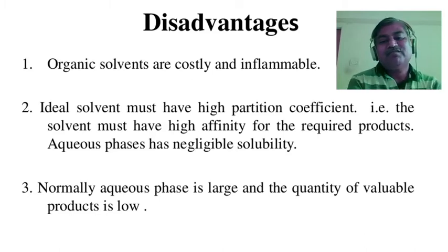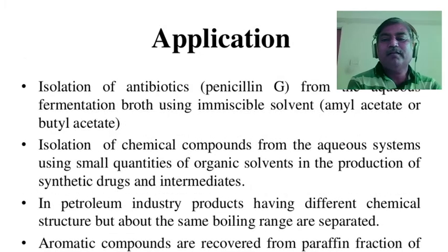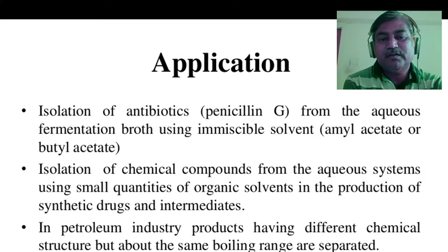And the aqueous phase has negligible solubility. Normally, the aqueous phase is large and the quantity of valuable product is low. Now, where it is observed, what are its applications.